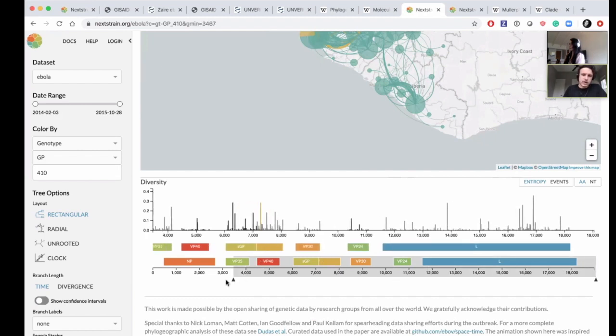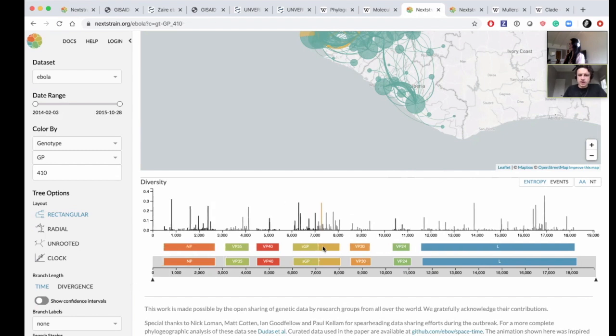This was also something that was surprising. Different parts of the genome are more and less relevant in terms of what a mutation in one place versus another might do. That's really where it gets into the domain specific knowledge that's specific to the virus and to the scientists.